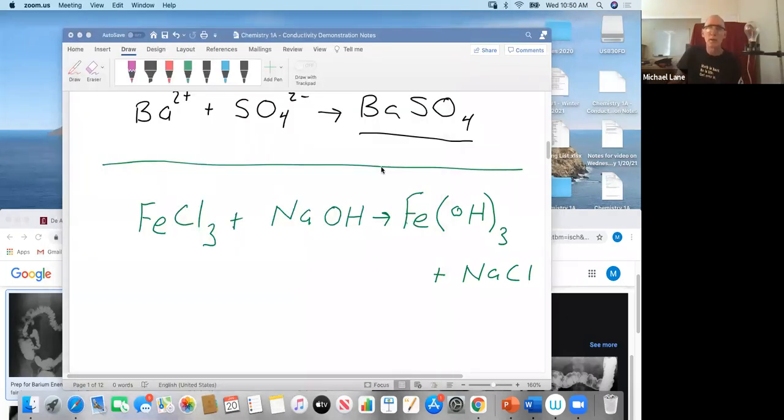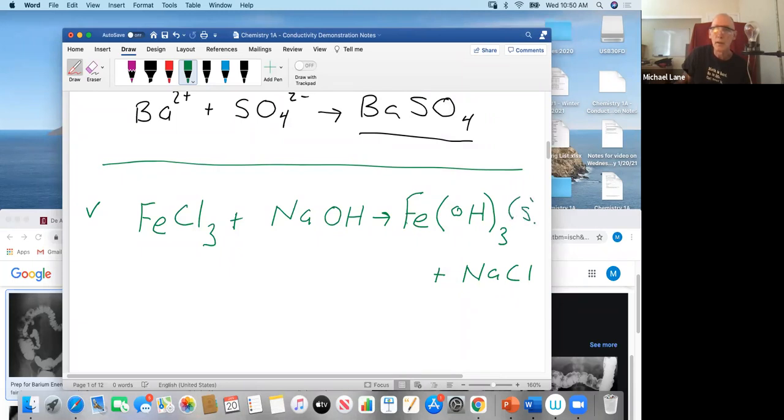So we observed a chemical reaction, right? We did an experiment, we added 2 things, we made an observation, and the observation is that a solid formed. So if our observation is a solid formed, then we conclude properly that there was a reaction that occurred. And this is the only potential double displacement reaction. Now, we know again from previous and from other experience that sodium chloride is soluble, so the only insoluble compound can be the iron 3 hydroxide.